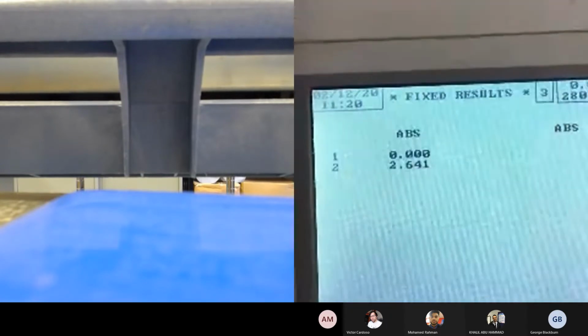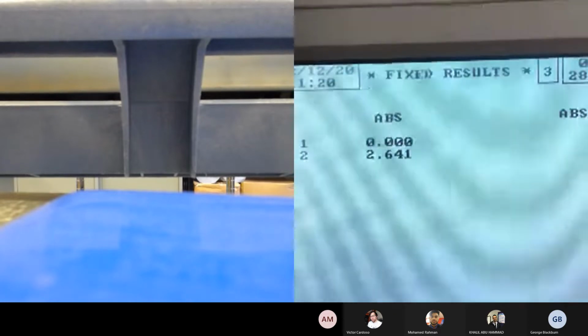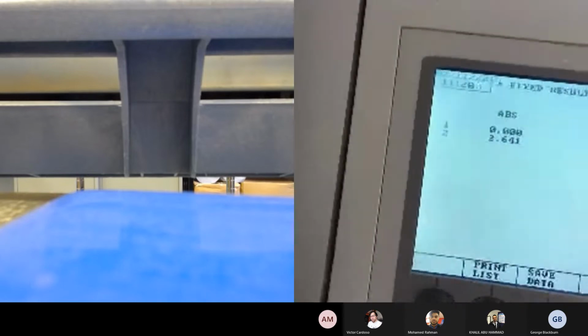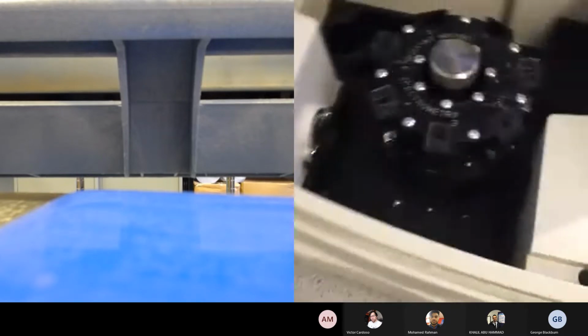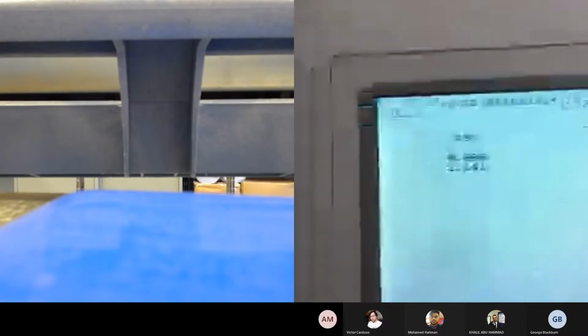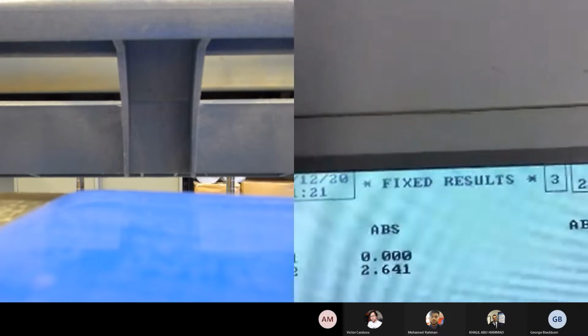Yeah. So you've added 10 mils of phosphate buffer to 1 mil of the solution. Yeah, great. So I've put samples of that diluted solution into the next 3 cuvettes, so numbers 3, 4, and 5. So if I press run 3 times and wait, then I'm going to be able to see 3 values for the absorbance, which should be in a range you can measure, and then you'll be able to take an average of those readings and find what the concentration of the albumin solution is.